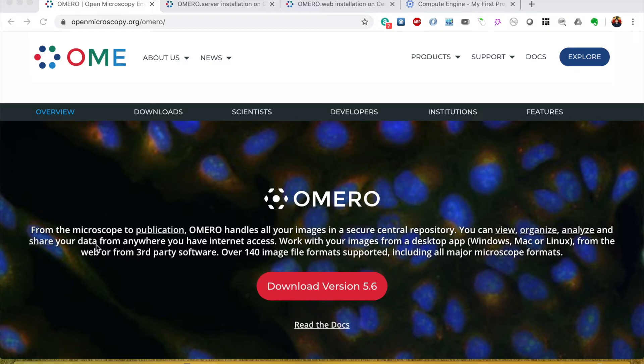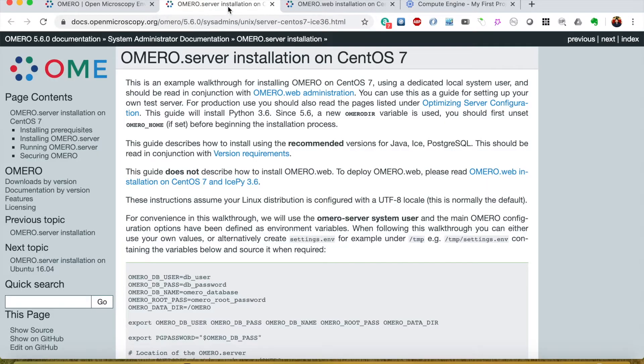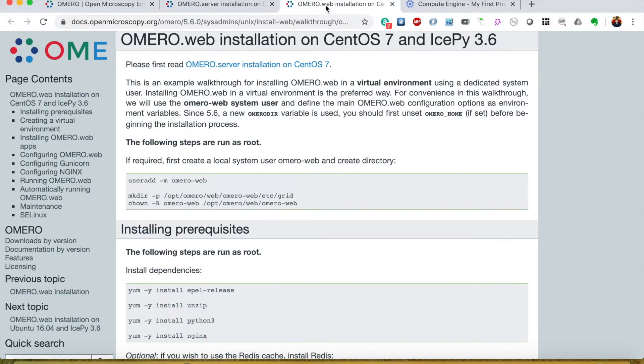It's particularly covering all major microscope formats but has more than 140 image file formats support. They have very good documentation on how to install OMERO on different platforms. I selected CentOS 7 so I will follow this guide to install OMERO server first and then the OMERO web interface which interacts with the OMERO server on the back end.